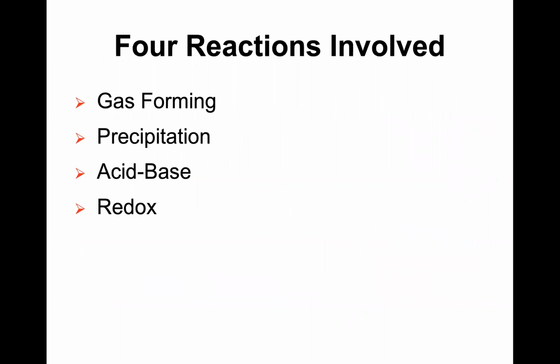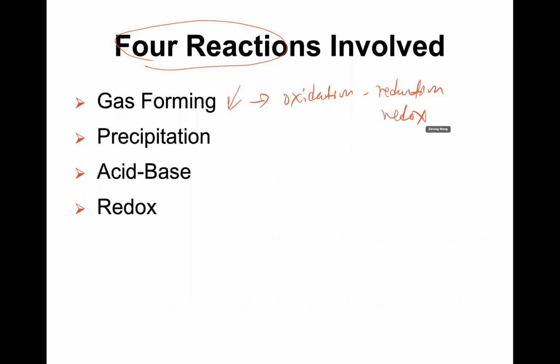For this recovery of copper, we will involve four different reactions. The first is a gas forming reaction, which, as you will see later, can also be considered an oxidation reduction reaction, which we simply write as redox, right?